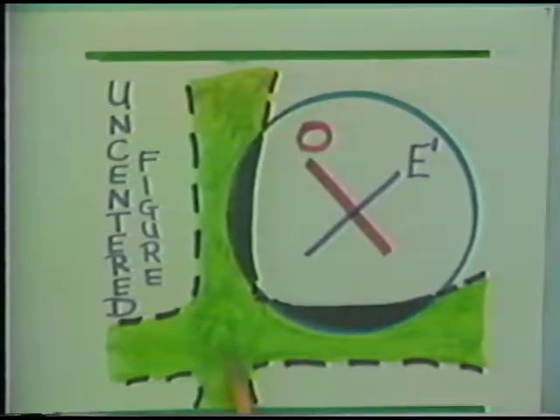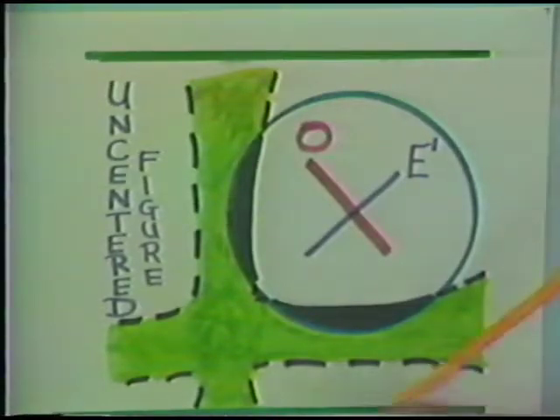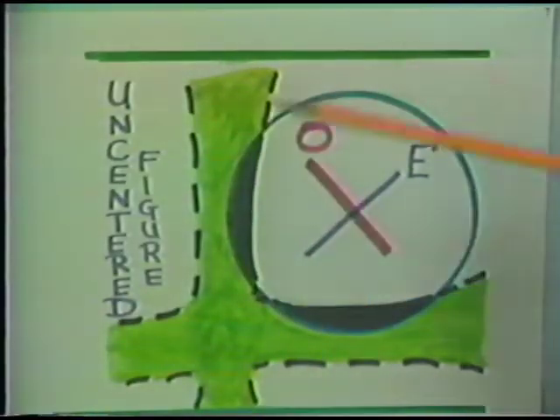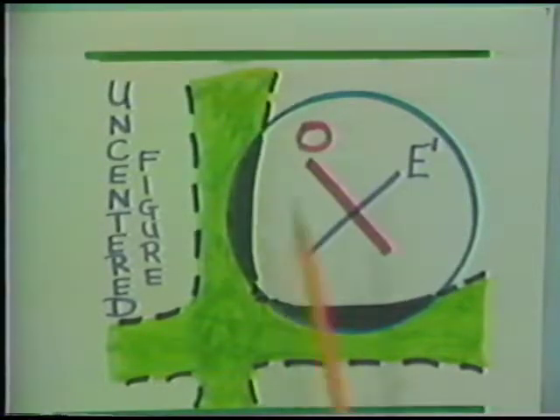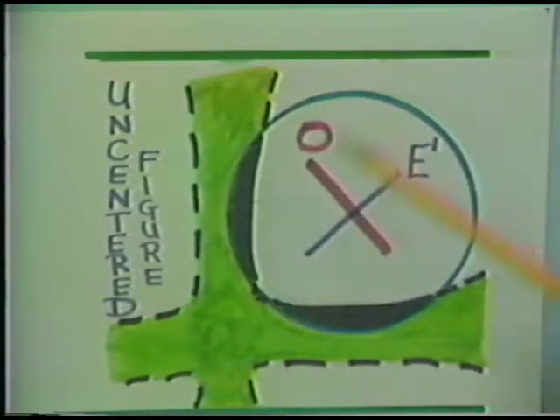Sometimes the center of the isogyre cross is actually within the field of view, and you can see this point, but many times it isn't, and you simply see the successive traversing of each of these isogyres across the field of view, usually in a perpendicular direction. And by watching this pattern, you can observe where the center of this cross is, even though it may be outside of the field of view. And so by rotating the figure in the proper way, you can position yourself so that one isogyre is here, another isogyre is here, and you're really essentially looking at the northeast quadrant.